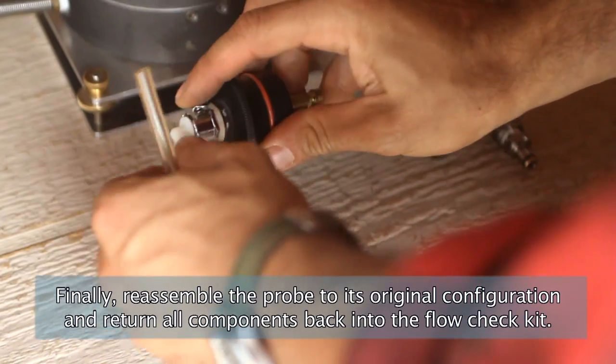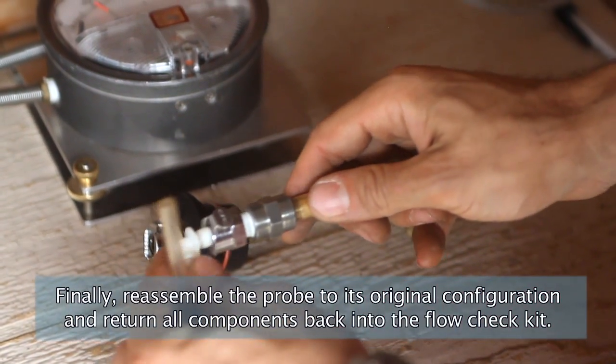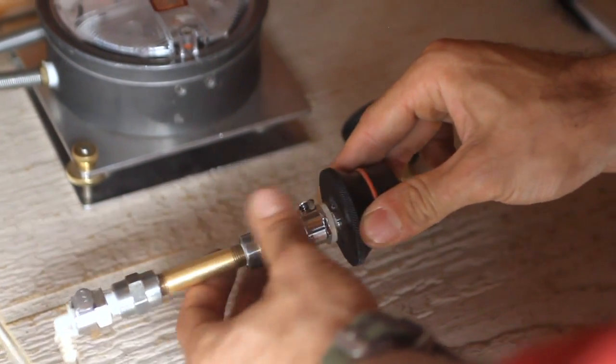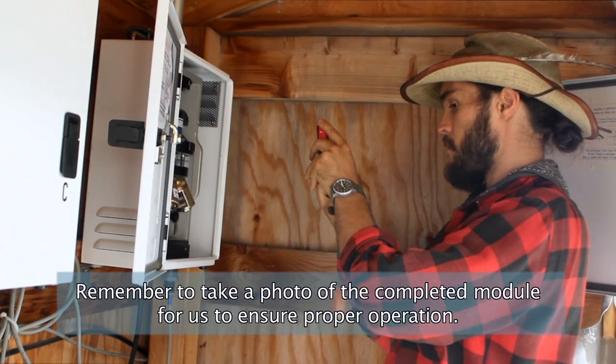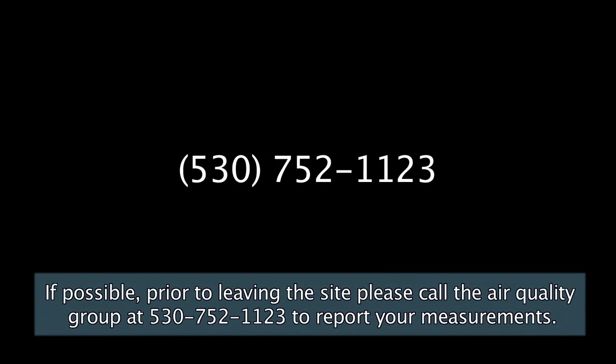Finally, reassemble the probe to its original configuration and return all components back into the flow check kit. Remember to take a photo of the completed module for us to ensure proper operation. If possible, prior to leaving the site, please call the air quality group at 530-752-1123 to report your measurements.